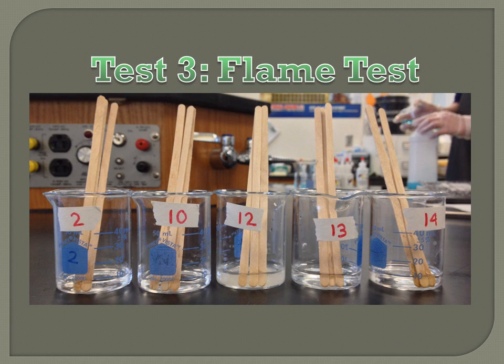The third test is the flame test. This requires you to soak 3 wooden splints in each solution for at least 12 hours. Be sure not to conduct this test on phenolphthalein, for it is highly flammable.